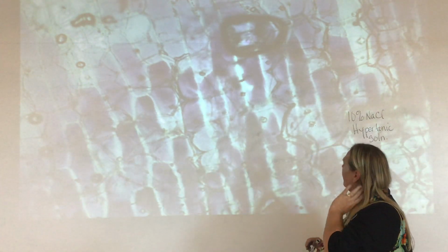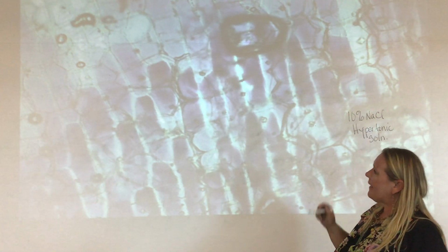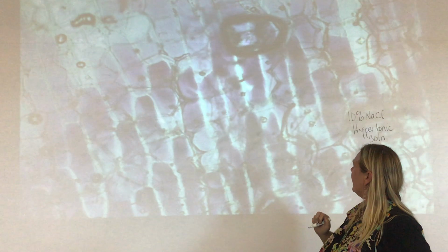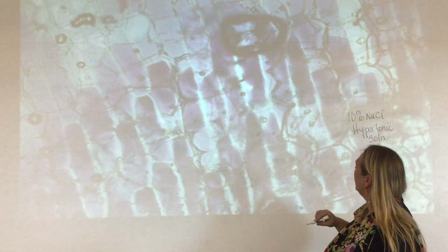Okay? So if I were to keep watching some of these, right? In the last one I said it was completely all filled in. There was nice pink bricks, solid right next to each other. We would over time see these shrink.